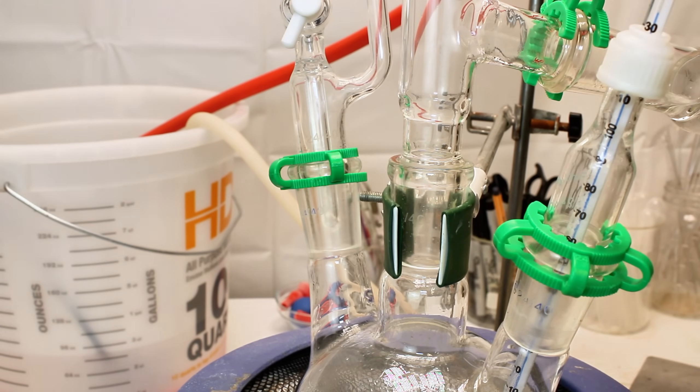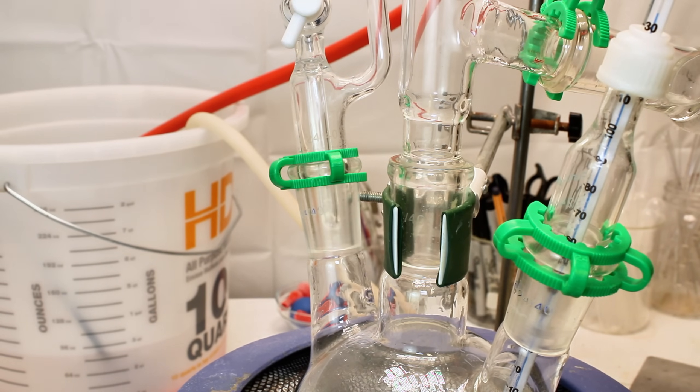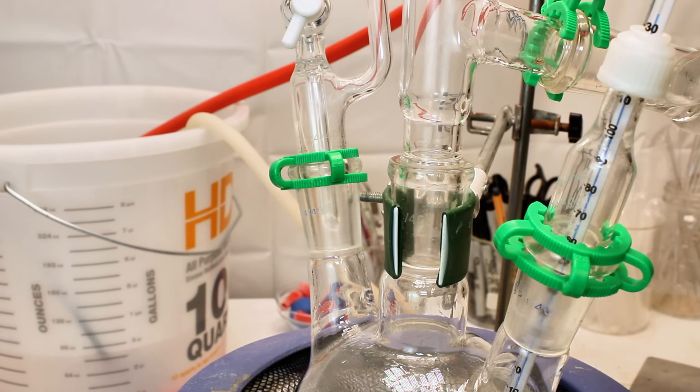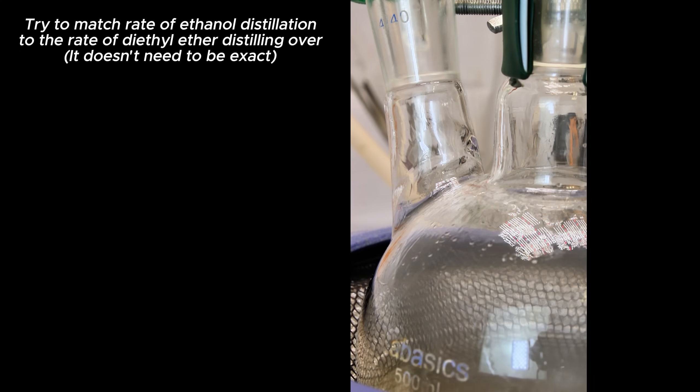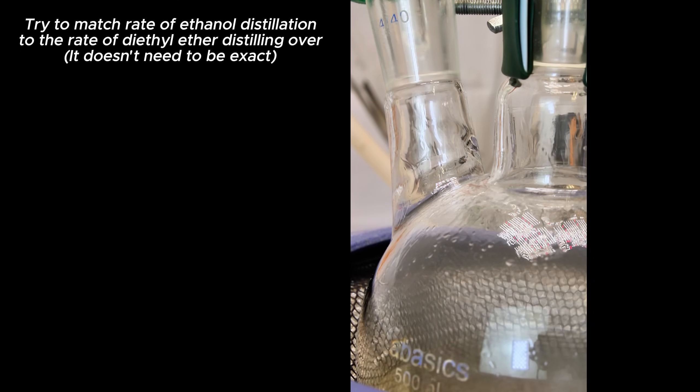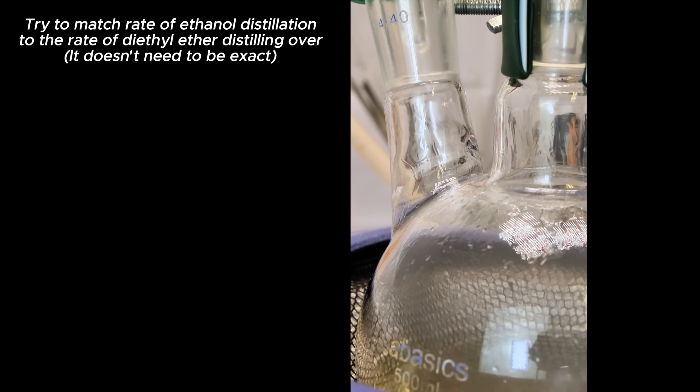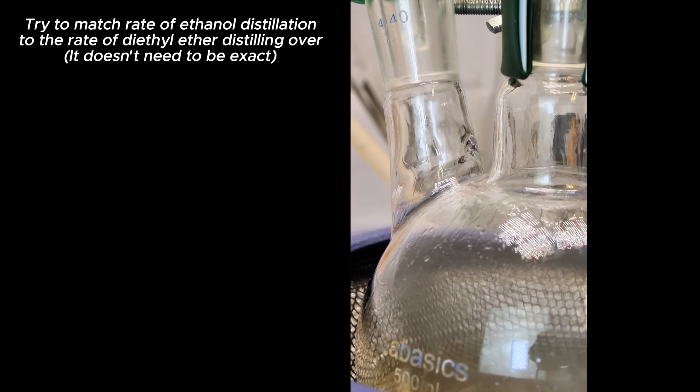As soon as the temperature reaches 130 degrees celsius and ether begins to distill over, I open the stopcock just enough that it allows ethanol to drip into the reaction mixture at roughly the same rate that the ether is distilling over. This is very tough to maintain though, so I periodically adjust the heating mantle and drip rate as the distillation speeds up or slows down.